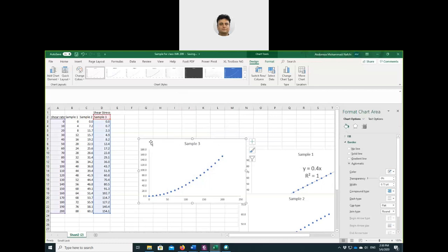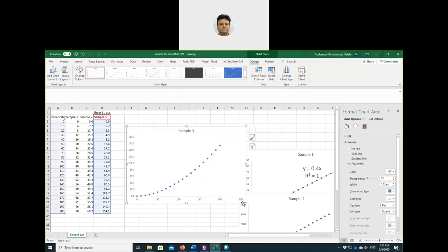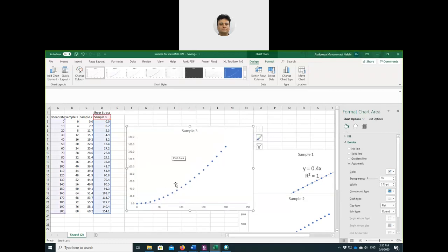Yeah, okay. This pattern, please guess. This pattern is for... Oh yeah, wait, that's correct. It's shear thickening. Yeah, this pattern is shear thickening.